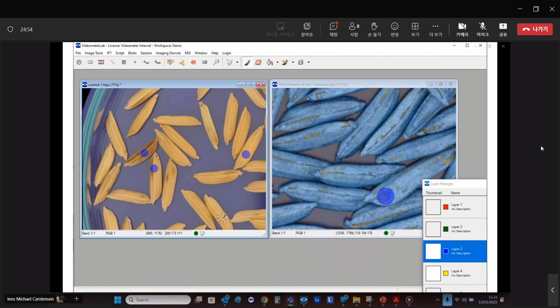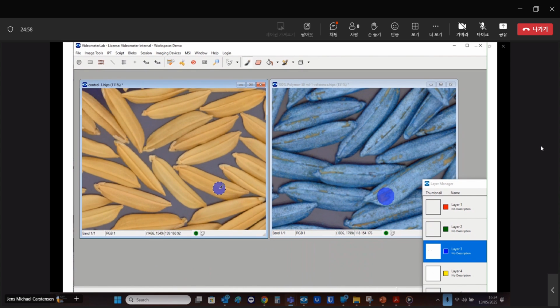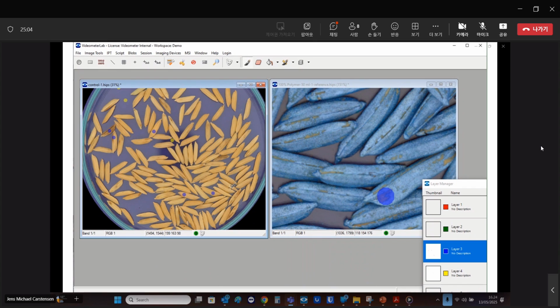I'm not considering the coating yet, but mainly different aspects of seeds in relation to the background. So this is the first part, and then I will come back to the painting when I want to do the coating transformation, but now we want to do a segmentation that segments out the seeds automatically.